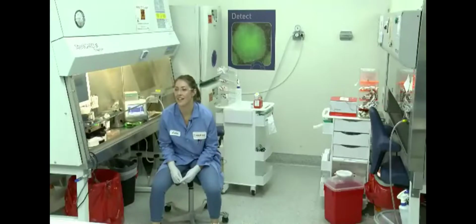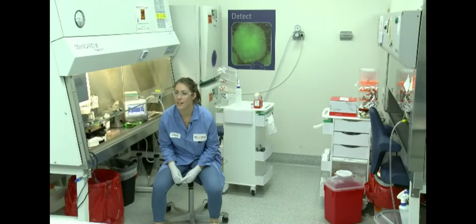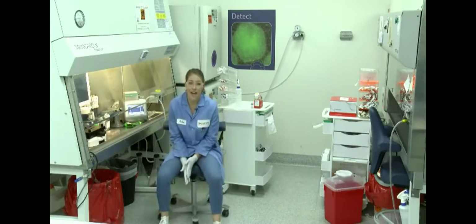Okay, so you mentioned several tricks to promote the survival of the cells after electroporation. Could you kind of ballpark how long it takes for the cells to recover and be ready for expansion and other experiments? So if you have the most optimized protocol for your cell type, you should start to see your cells adhering to the plate and looking healthy after about 24 hours. And then your cells will grow at whatever rate your cell type tends to grow at, and then you can expand from there.